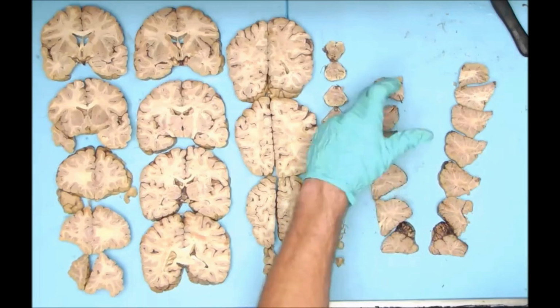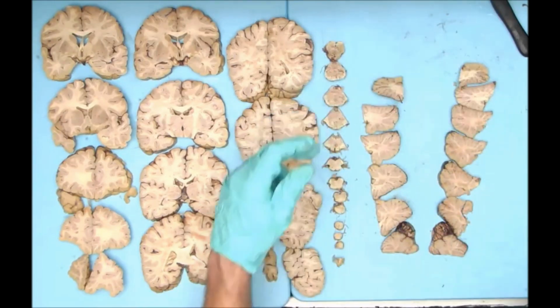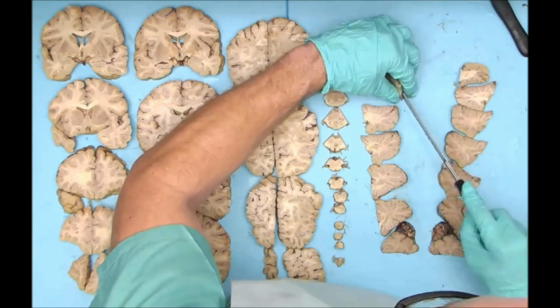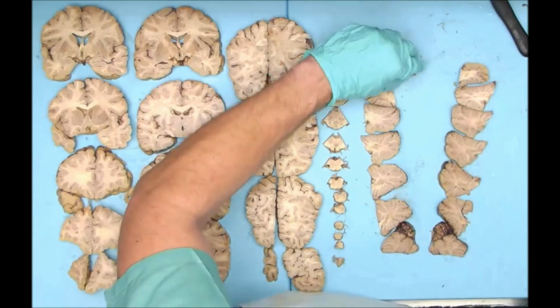And you notice on one side I have 6 slices, this side I have 7 slices, so I'm going to make an additional section for this last portion of cerebellum here to make it more even.